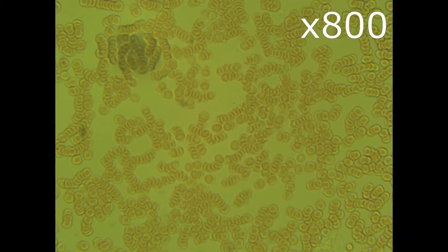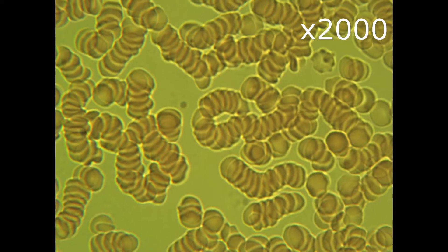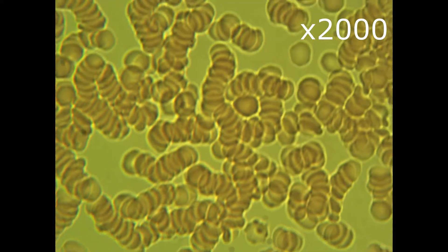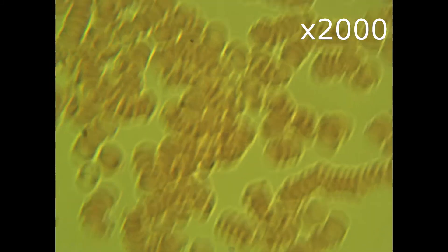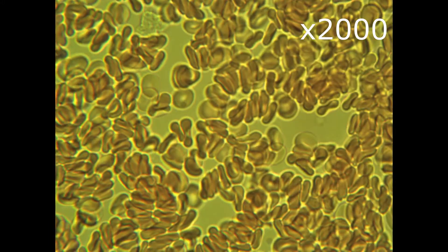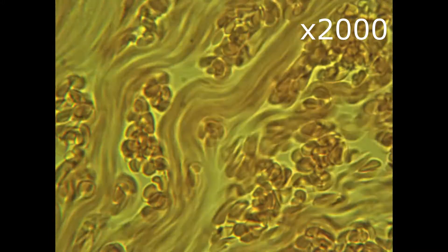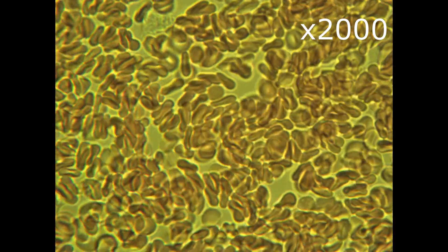And now 2000 times. Indeed, there is no impact on blood whatsoever. I think it is because the main function of hydrogen peroxide is to fight viruses and bacteria. Just to break into it. Let's see if flow is improved. It seems that flow slightly improved. Red blood cells are elastic and moving well.